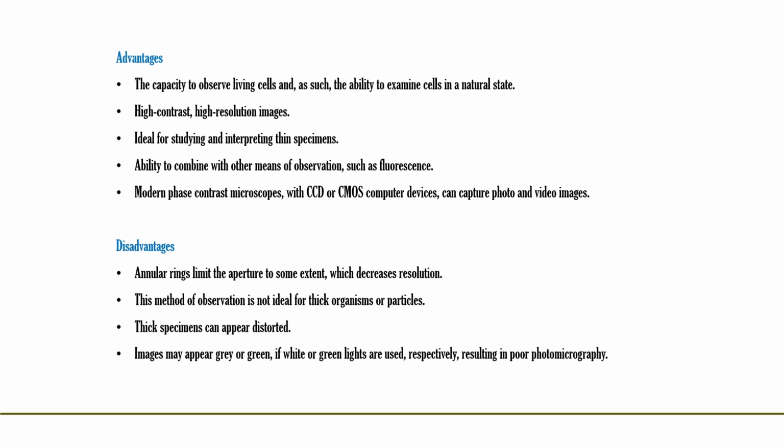Applications of phase contrast microscope. Determine morphologies of living cells, such as plant and animal cells. Studying microbial motility and structures of locomotion to detect certain microbial elements, such as the bacterial endospores.